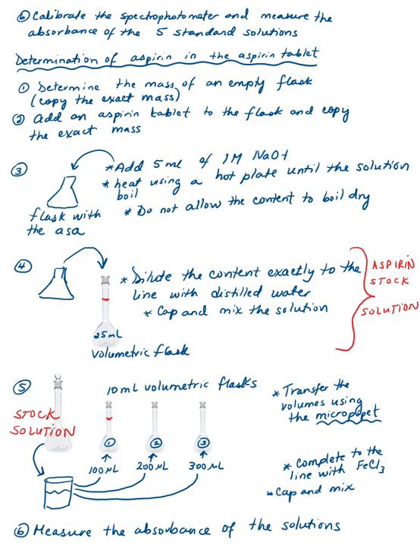So a different thing that's happening in this part versus the previous one. In the previous one, you were using acetyl salicylic acid, only that. In your sodium hydroxide, the acetyl salicylic acid will dissolve entirely because that's the only substance that you have. In the aspirin tablet, you have different components. Not all the aspirin is acetyl salicylic acid.